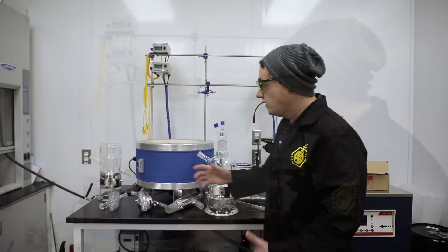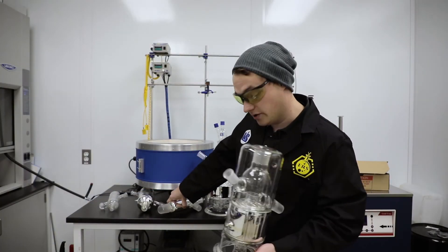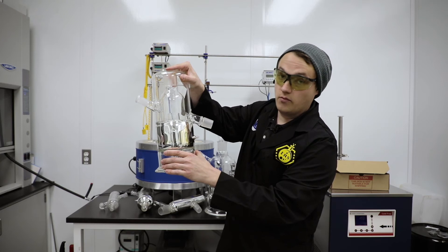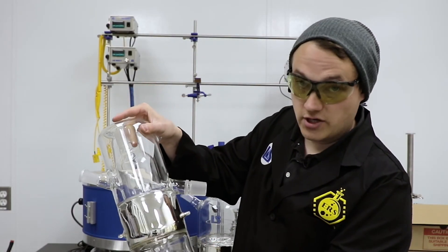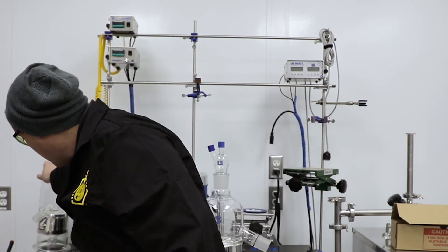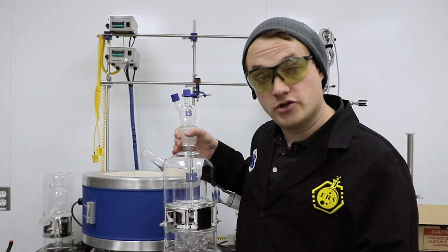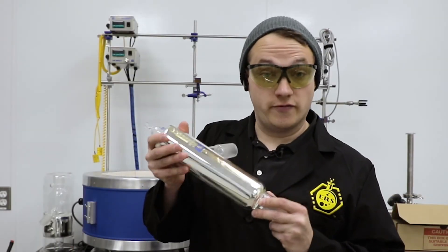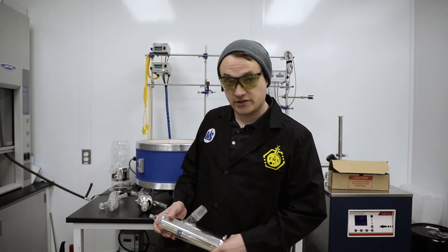The big thing about going to these reactor flange heads, and the main reason we didn't release that one, is because it costs a lot of money to make versus the smaller head — a lot more money for the customer. Not only that, but it requires a specialized mantle that fits this size, as well as an insulative jacket for the part where the glass welds are for the flange connection. We are not able to silver that portion because it's not able to be vacuum-jacketed since it's the part that connects to the flask. As a result, we made a mantle insulator that works extremely well to retain the heat. But between all those added costs, we decided to wait and work towards something larger that actually gives the customer a lot more benefit, versus the slight benefit over our 45-50 and 60-50 heads. The 60-50 head, which is the larger version, actually runs at the same speed as the reactor flange head — so why would we release something that costs so much more for little to no gain?